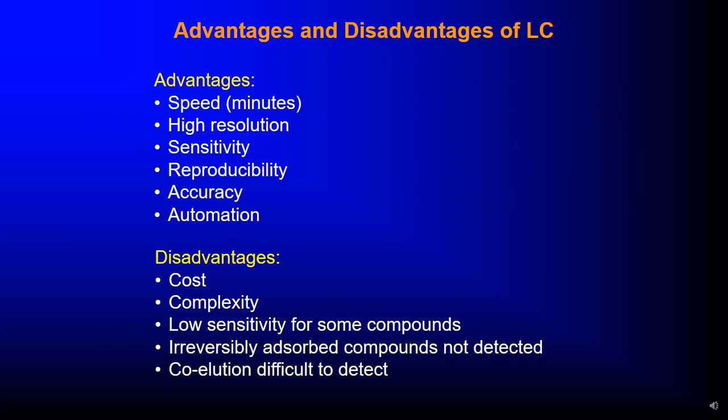Then we have the advantages and disadvantages of liquid chromatography. The advantage is that it has good speed and high resolution. It is very sensitive. The results are reproducible. Then it's accurate and it can be automated.